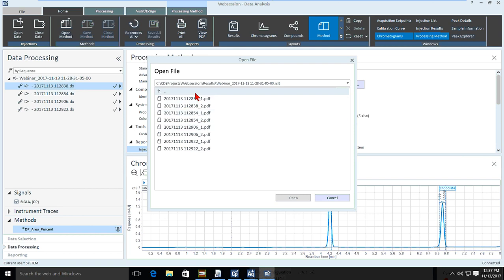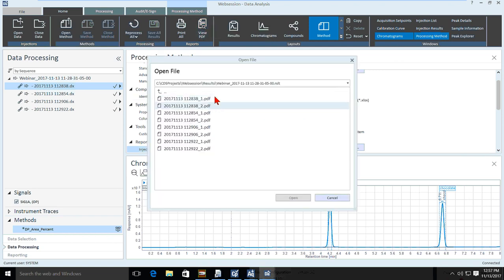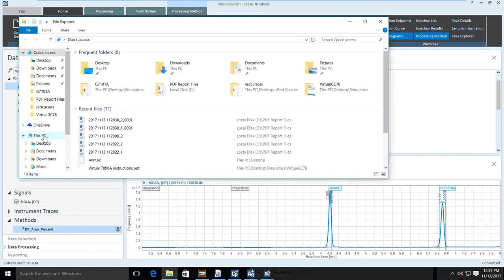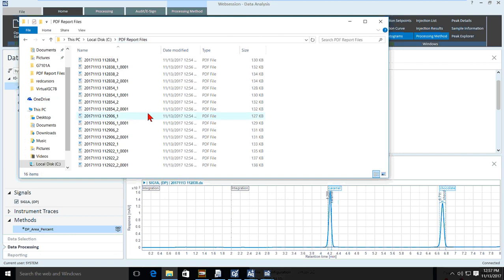if I want to see it, the results file, so now I've got 2 locations because we added the second location on the reports file. So that's why the view PDF is looking at my results folder, and it's not looking at, let me go back to the second location. All right. So that's how you're having 2 locations for your templates.